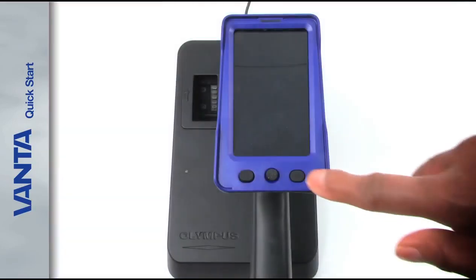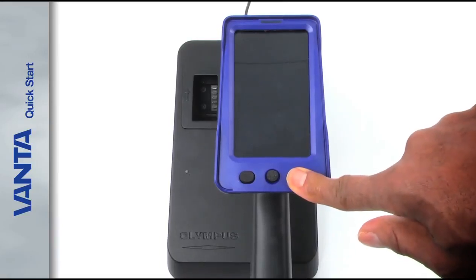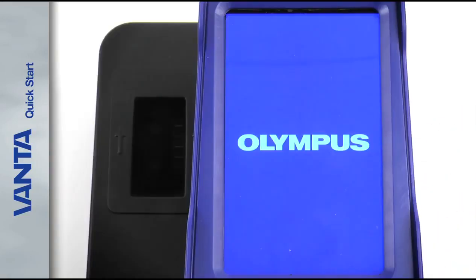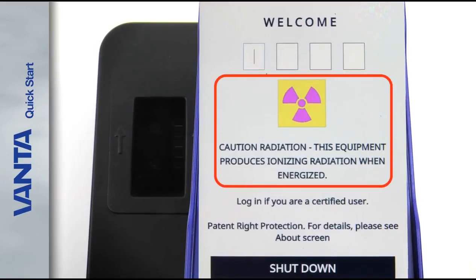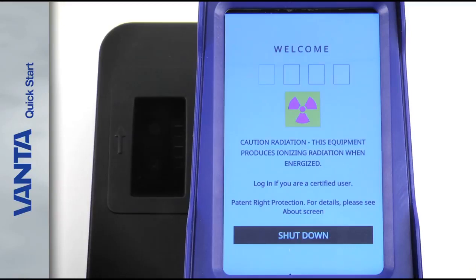Press the power button on the back of the Analyzer to turn it on. The Vanta welcome screen appears. Make sure to read the radiation safety warning.